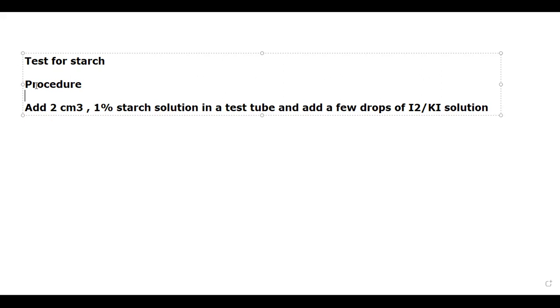You need to take 1 gram powder and dissolve it in 100 gram water. Okay, so that is how we prepare that 1% starch solution.